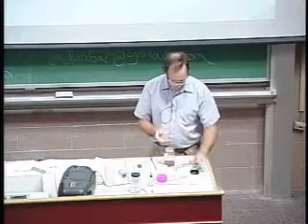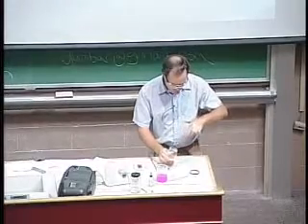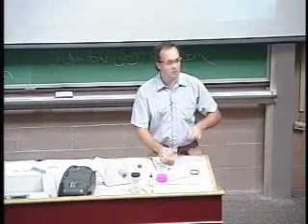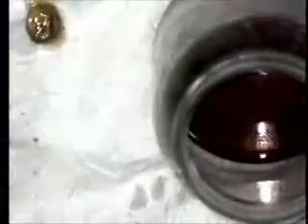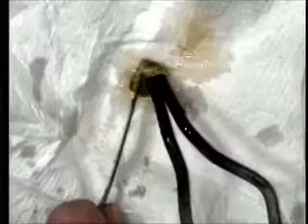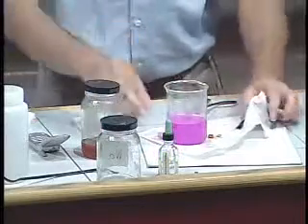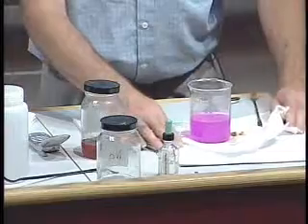That's sodium. Not only do we find similar chemistry in a group, but we find a progression of some of these properties. The atomic weight gets larger as you go down the group, and reactivities often increase. We expect the same sort of behavior for any element in group number one. So we have hydrogen, lithium, sodium. Below that is potassium — there it is there, you can see a nice shiny part. The solution's already alkaline; it would also turn alkaline with the introduction of potassium.